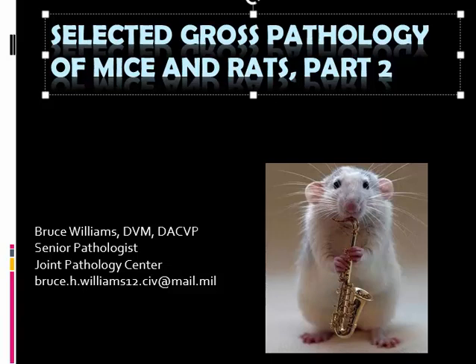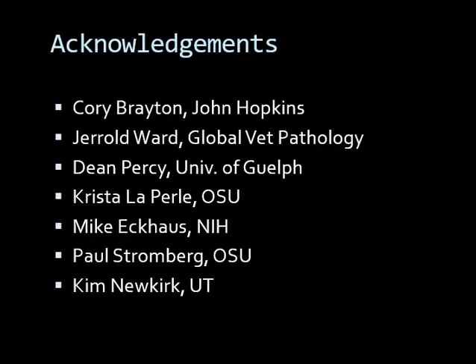Hello, it's Bruce Williams again, and today I want to present part 2 of my series on the selected gross pathology of mice and rats. And we're going to talk about the hematolymphatic system and the gastrointestinal system of mice today.